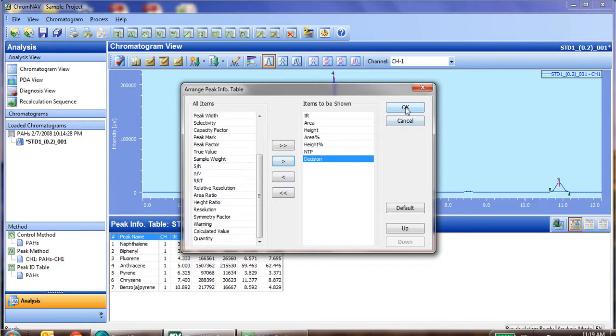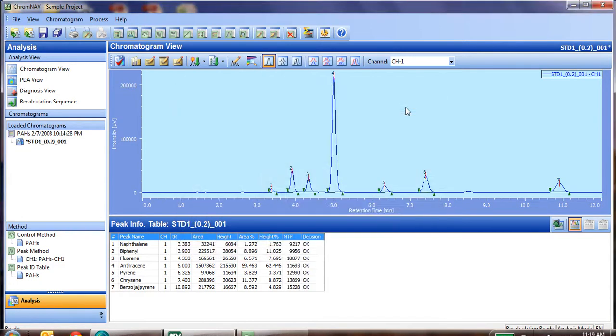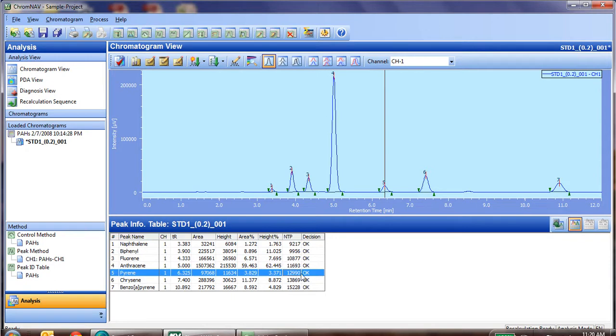So we add those two, click OK, and what we notice is that indeed, pyrene has more than 10,000 theoretical plates, and the decision is OK, obviously, as we have passed our test.